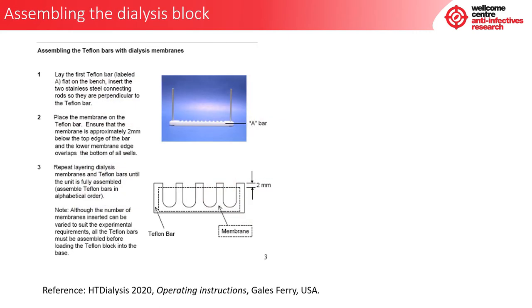Now the dialysis block can be assembled according to the manufacturer's instructions. The instructions from HT Dialysis are as follows. To assemble the Teflon bars with dialysis membranes, first lay the first Teflon bar labelled A flat on the bench. Insert the two stainless steel connecting rods so that they are perpendicular to the Teflon bar. Place the membrane on the Teflon bar, ensuring the membrane is approximately 2 mm below the top edge of the bar and the lower membrane edge overlaps the bottom of all wells. Repeat layering dialysis membranes and Teflon bars until the unit is fully assembled, in alphabetical order. Note that all Teflon bars must be assembled before loading the Teflon block into the base.